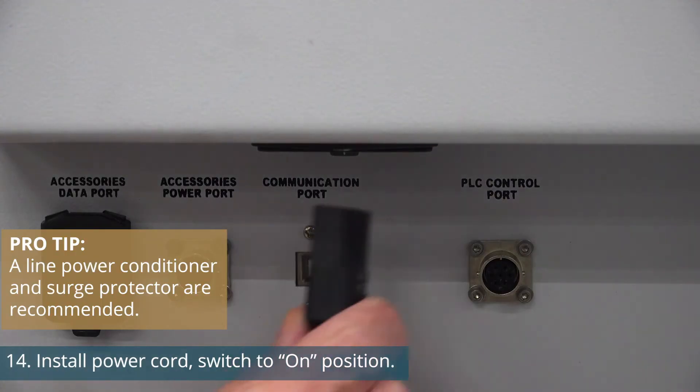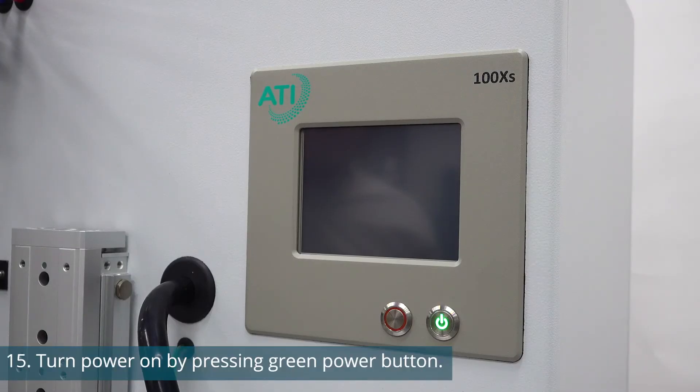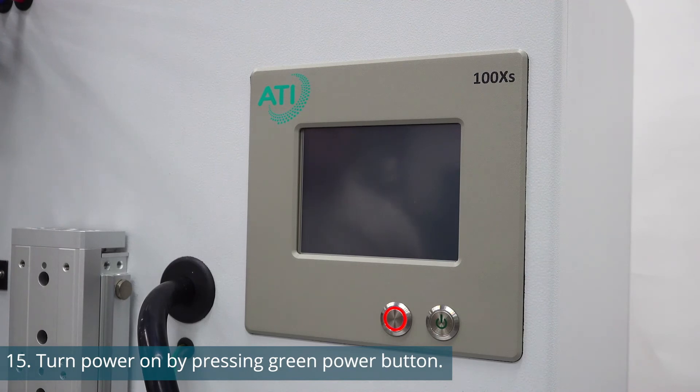Now we're ready to install the power cord. Install the plug and turn the switch to the on position. You're now ready to turn on the 100X. Press the green power button on the bottom right corner of the touch screen bezel. The unit will begin initialization.